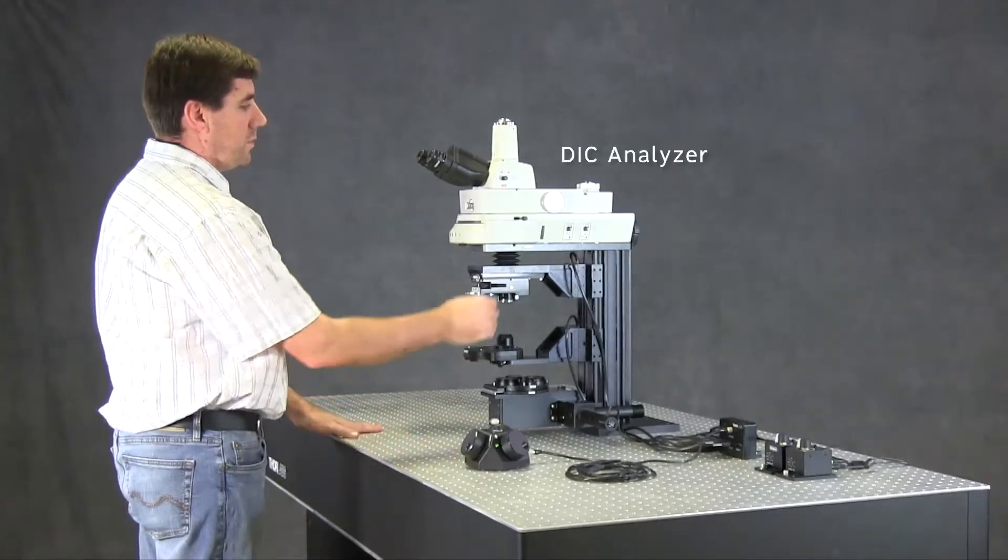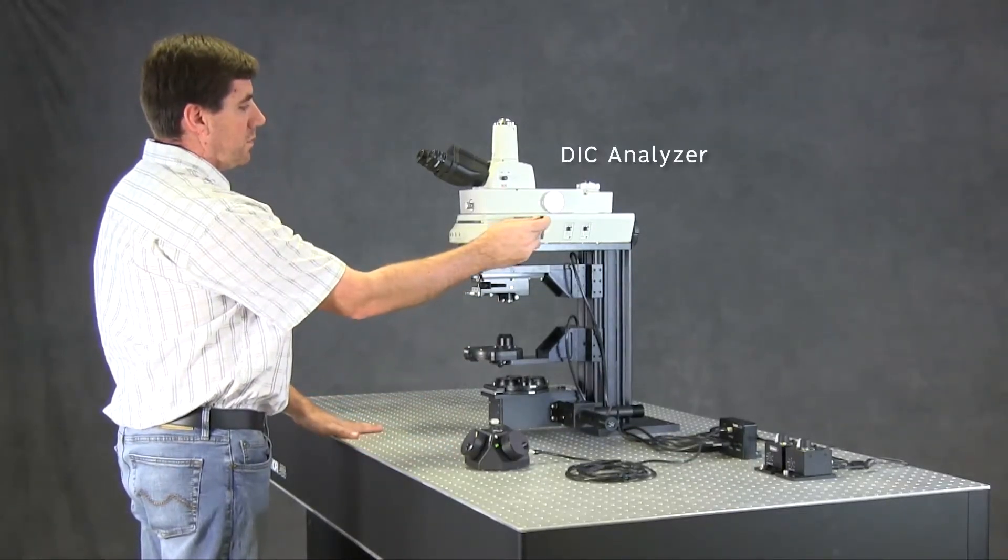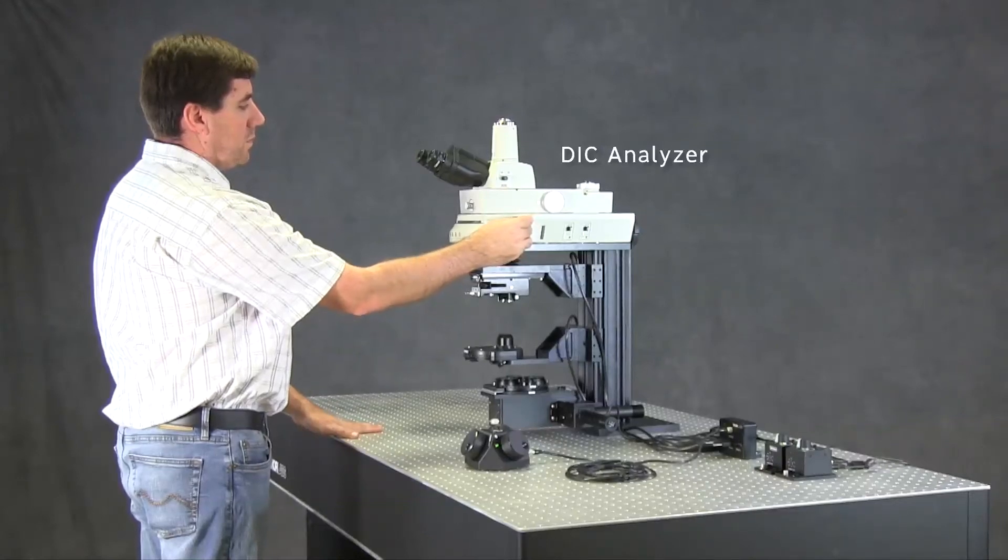For DIC, the microscope includes a DIC analyzer. It contains two polarizers for either the visible or the near-infrared.